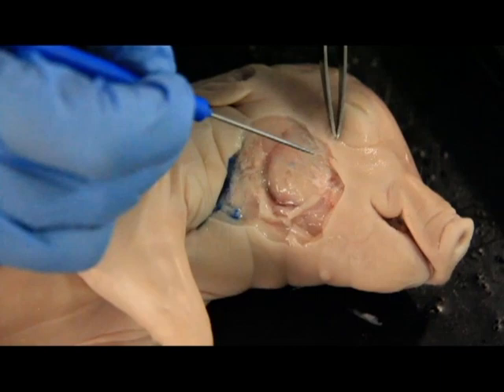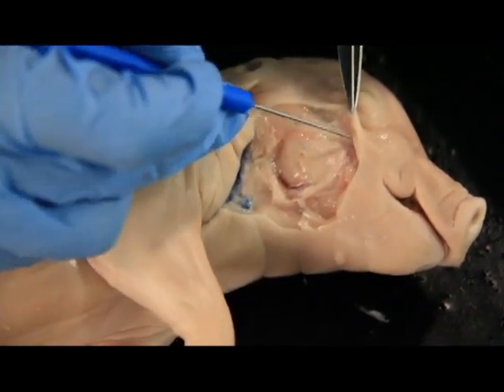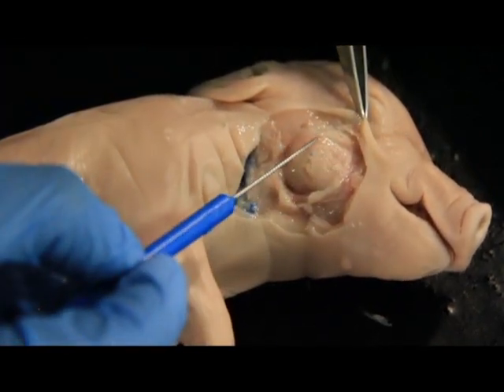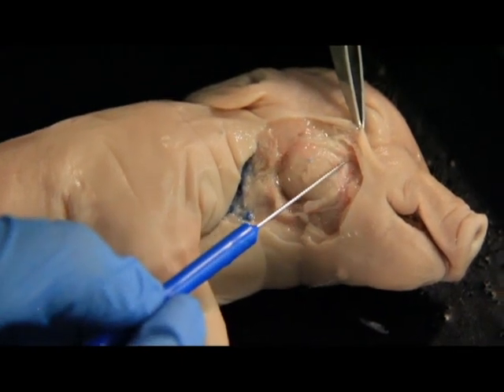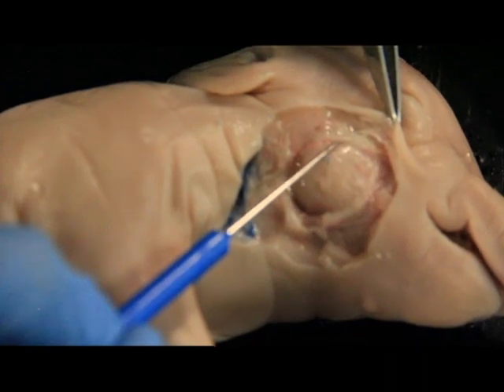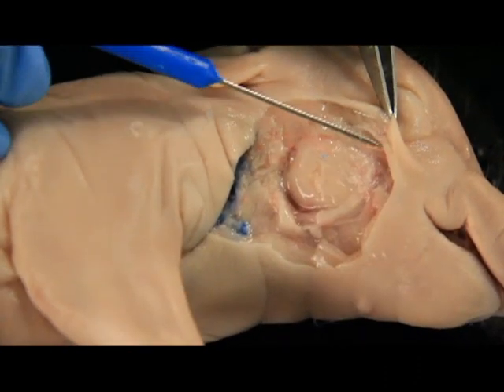Really getting through here. Seeing this nice, clean cutting. Okay, so what we can see right here, this very small white line. And you notice it goes across the top of the masseter muscle. This is the masseter muscle here. This very thin white line that goes across, this is your facial nerve right there.